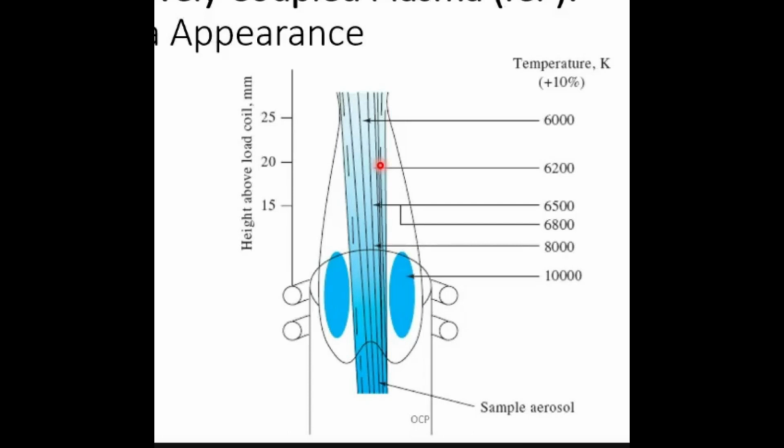So you will not be able to analyze your sample accurately. So ionization may be a problem. It is okay to obtain temperature using those ions, but if that ionization goes out of hand, it causes problems.